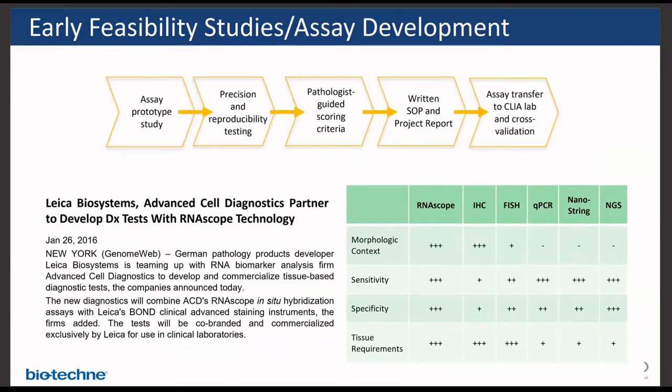So this method development is documented in a shared SOP, and a study report, which includes optimized assay conditions, is also provided. So we work with our field application scientists to transfer these types of studies to, for example, CLIA sites and CLIA labs, and then we make sure their results match our results, pretty much.